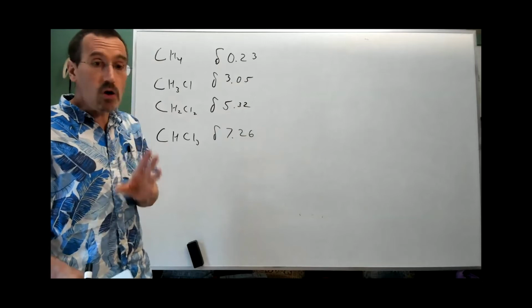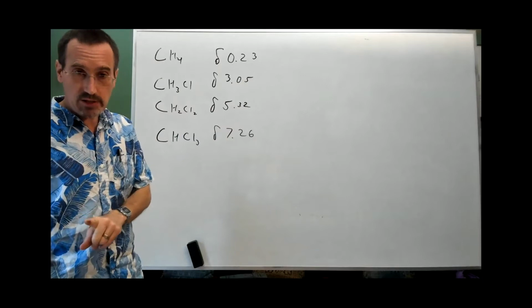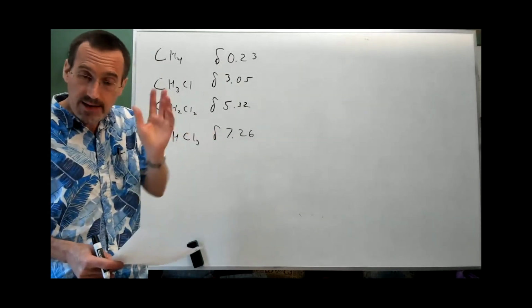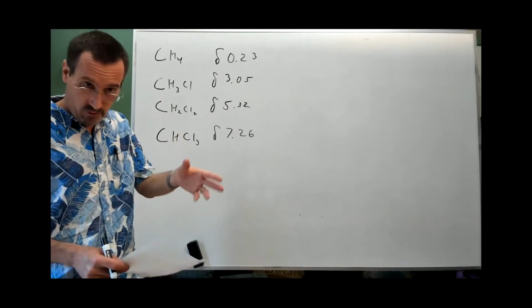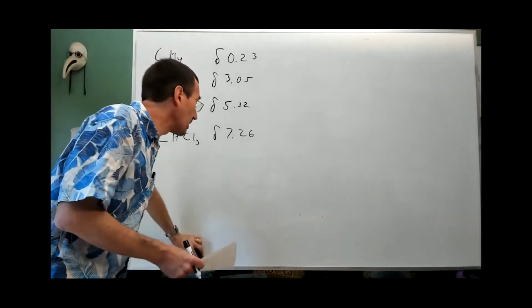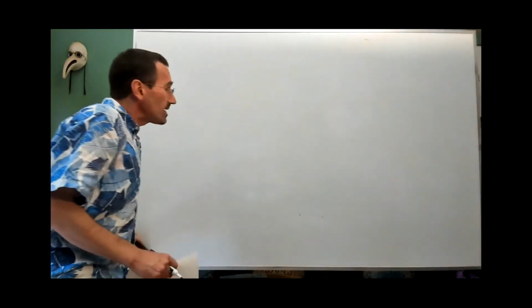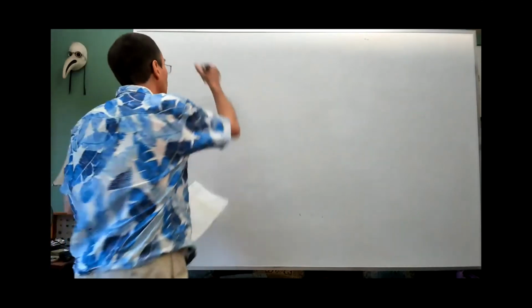And we're going to use that first to calibrate our own intuition, to be able to see the effects of substituents. And then I'll show you how chemical shift calculators use these empirical additivity rules to come up with estimates of chemical shift. Now, I find it incredibly useful to have a reference frame.